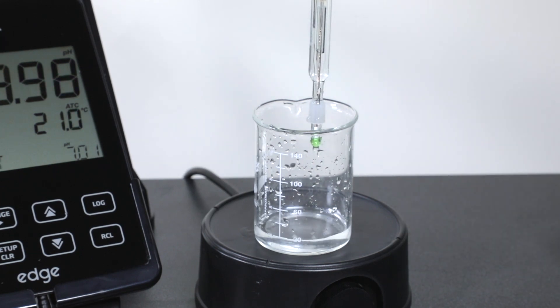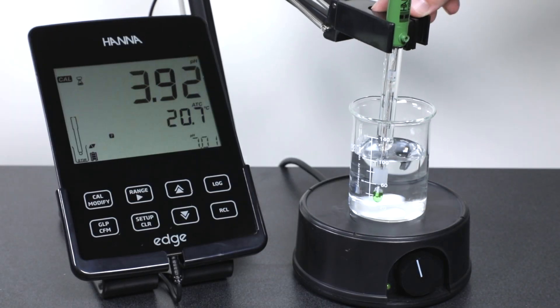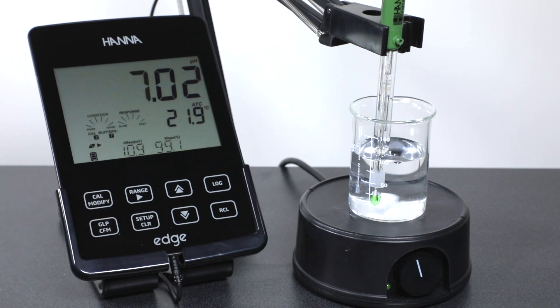Once rinsed, place your pH 7.01 beaker onto the magnetic stirrer and turn the stirrer on. Place the electrode into the 7.01 buffer and wait for a stable reading. Once stable, press confirm. To complete your 2-point calibration, press the Cal button and your calibration will be saved.